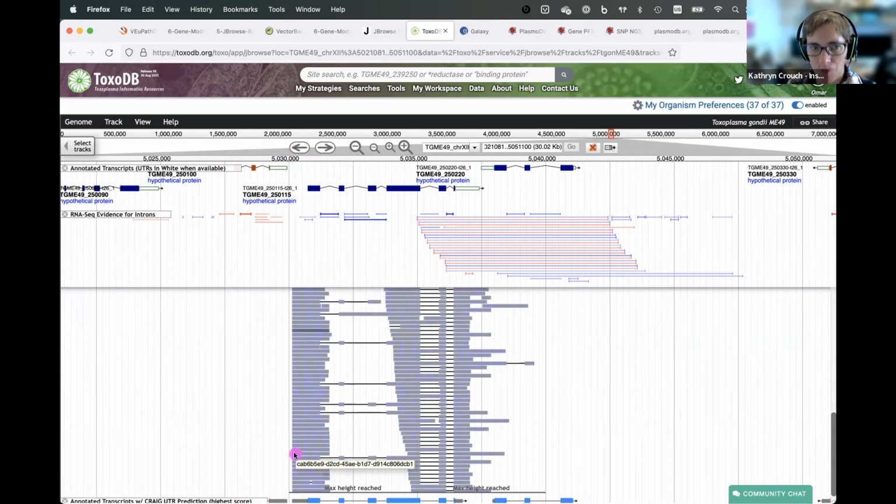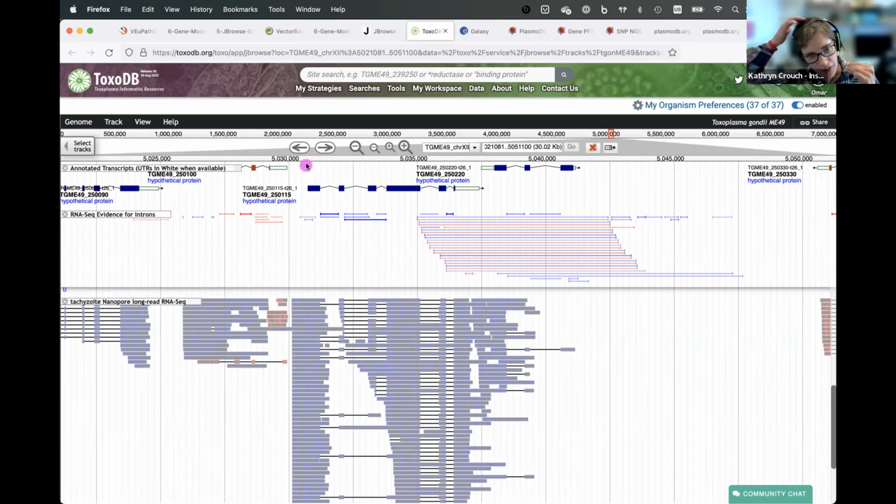So I can comment a bit here. This particular data set is actually very 3' biased. So you often can't draw good conclusions about the 5' end of your transcript from it, but you can draw reasonable conclusions about the 3' end of your transcript.